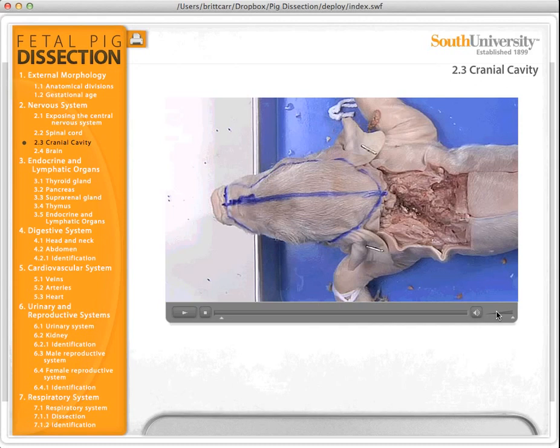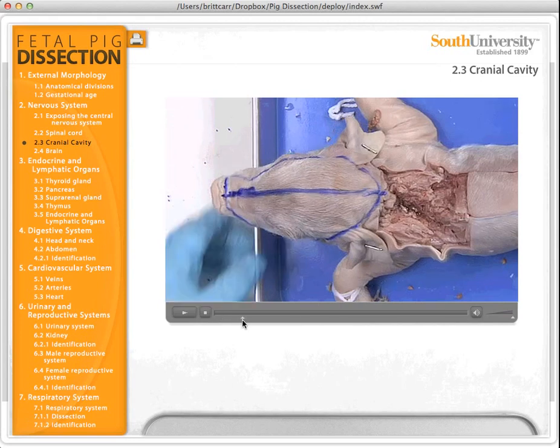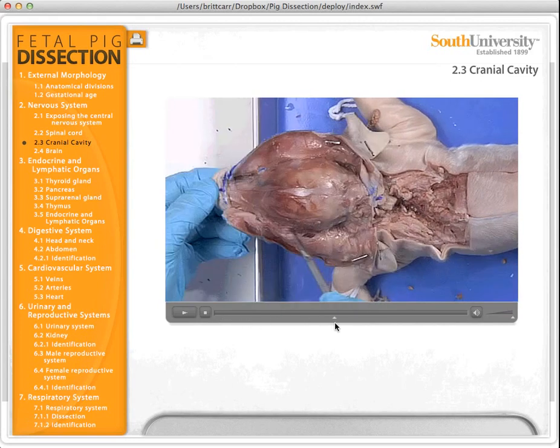For the activity, a video of each step of the process is shown to the student, and as particular portions are exposed, each body part is identified and its function is discussed. Then it's the student's turn. They have to use the tools available and follow step-by-step prompts to perform the procedure themselves, like I'm going to do now. So here's the video that actually walks through step-by-step what the students are supposed to do.